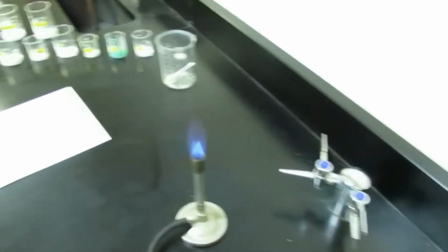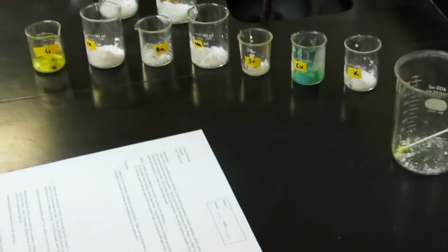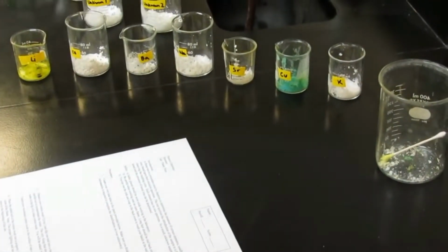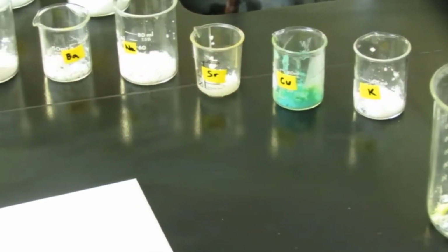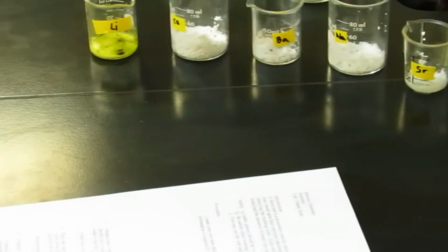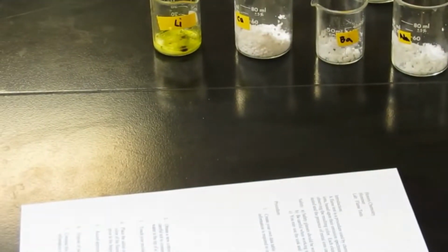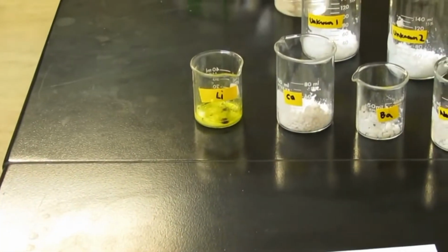So there's our flame. We're going to use that, and we are also going to use the following salts. From the right to our left, we have a potassium salt, a copper salt, a strontium salt, a sodium salt, a barium salt, a calcium salt, and it looks like a lithium salt. Those are all chlorides of those salts.